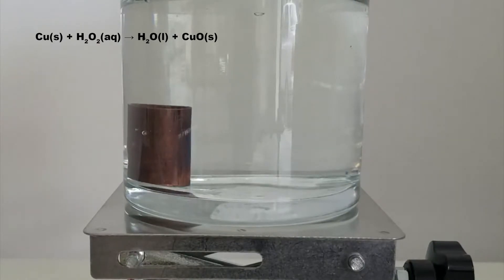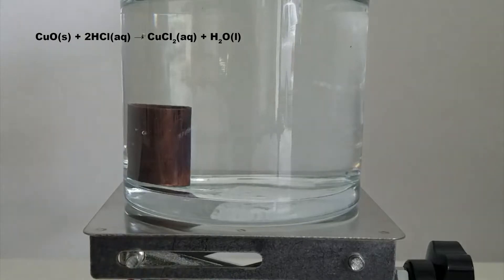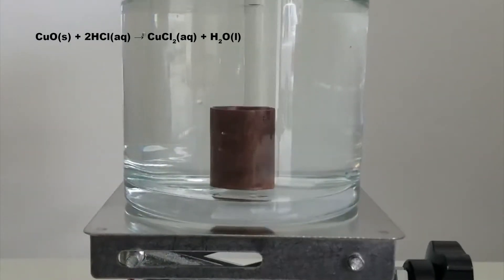I'm not sure how well the camera picked up on it, but if you look closely, you can see the solution turning light blue around the copper. This is the copper oxide reacting with the hydrochloric acid to form copper chloride, which has a blue-green color when dissolved.